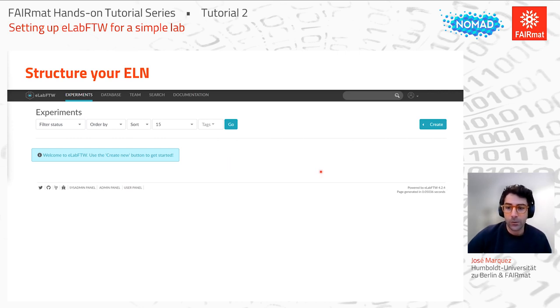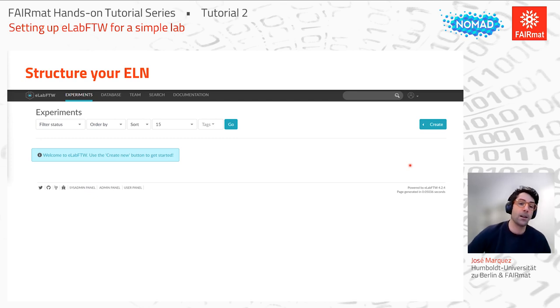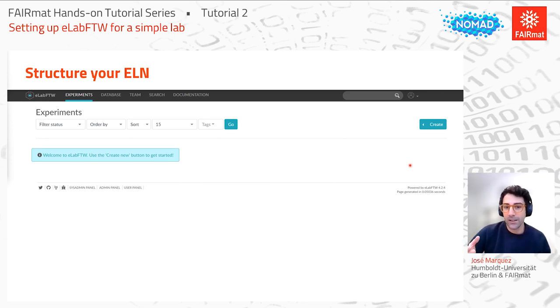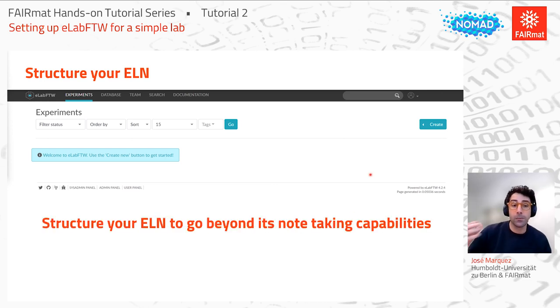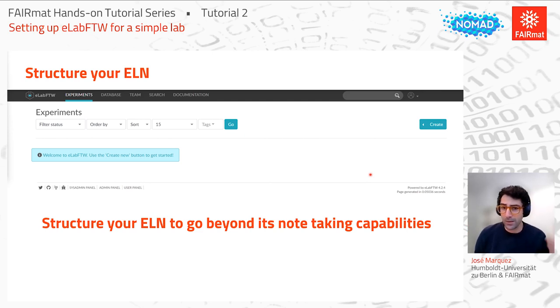If you've never used an ELN before, you might intuitively just click the Create button. A window will pop up with a generic experiment template and you might just start typing what you're doing. But if you do it like that, you'll be using eLabFTW like a basic note-taking app — similar to OneNote. To really benefit from an ELN it's really important that you give a decent structure to your ELN, to go beyond its note-taking capabilities.